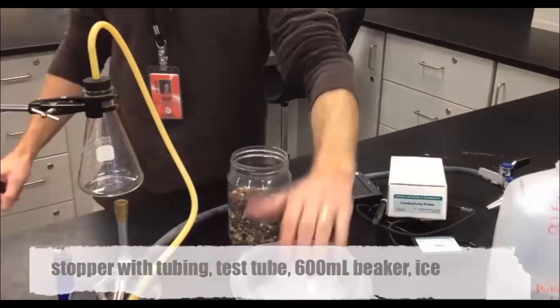To your 250 milliliter Erlenmeyer flask, go ahead and add a small handful of rocks. Those are going to be boiling chips that are going to allow the salt water to boil at a normal amount without overboiling. To the Erlenmeyer flask, also add 100 milliliters of salt water. Replace the cap on the Erlenmeyer flask.